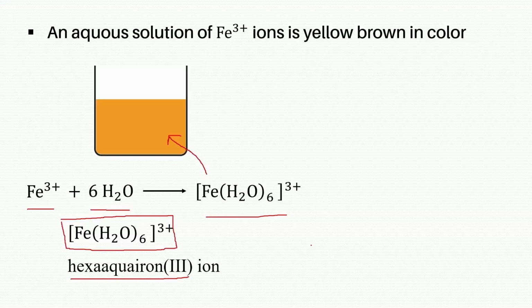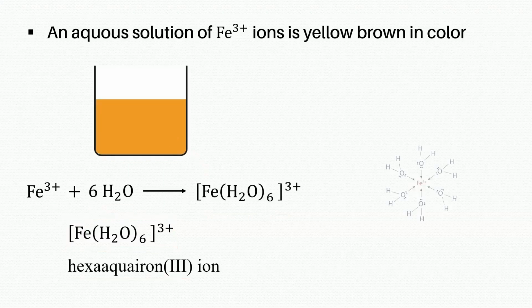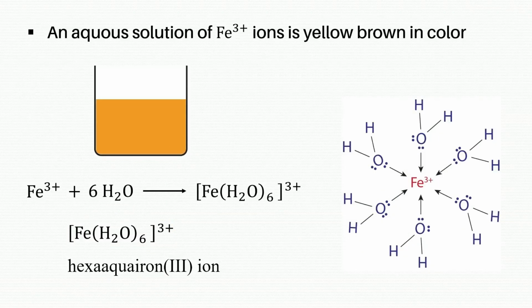Same thing happens here. It is also the same as the previous one. This also has an octahedral geometry. It also has a central Fe3+ ion, and it is surrounded by 6 water molecules. Here also water molecules act as ligands.